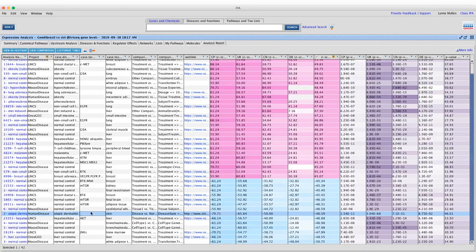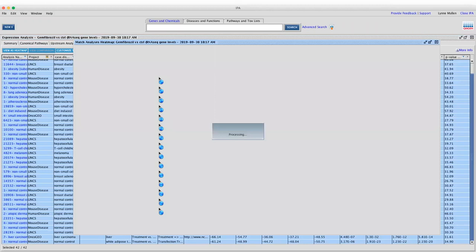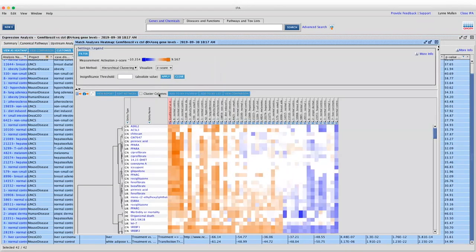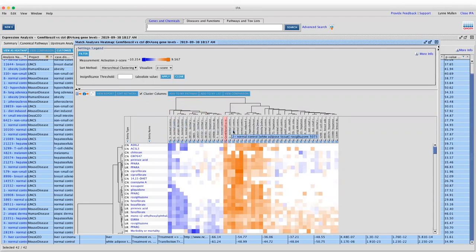You can also click on individual results and run a comparison analysis for up to 20 total analyses to go into even more detail.